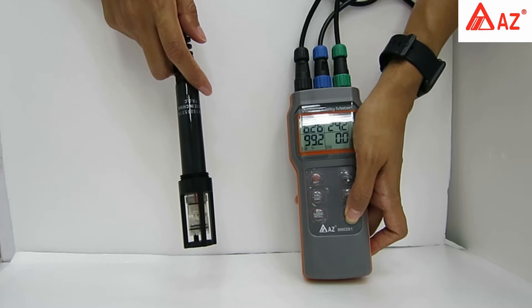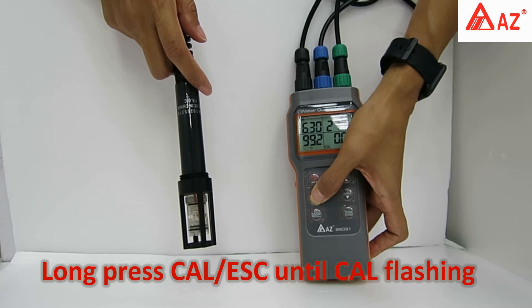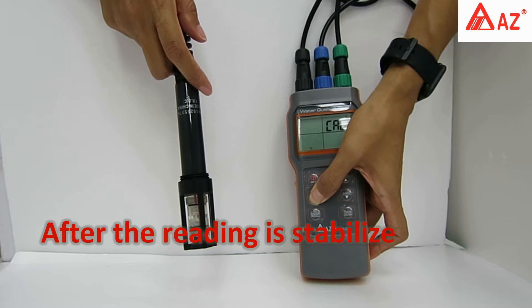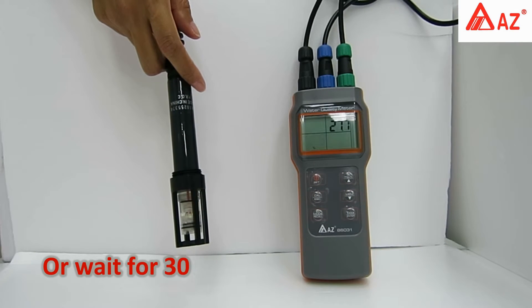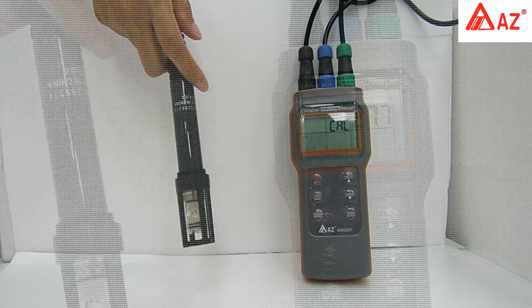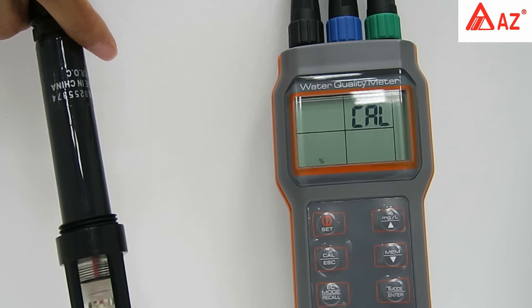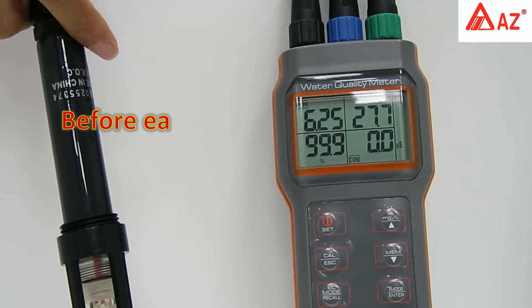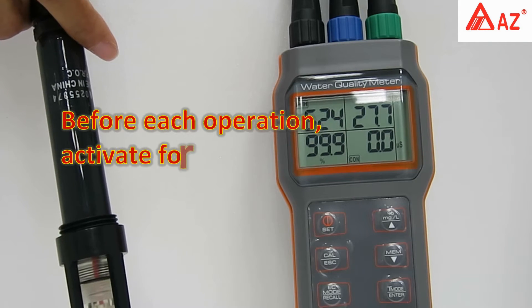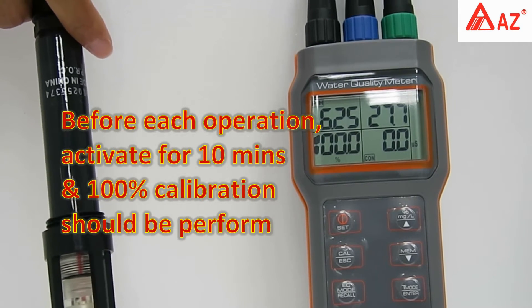Hold the DO probe in the air. Press T/Mode to switch to DO, then long press Cal until the Cal icon appears on the LCD. After the reading is stabilized, press Enter or wait about 30 seconds. The SA icon appears when the result is automatically saved and it returns to measuring mode. For accurate readings, turn on the meter 10 minutes before each operation and perform the 100% saturation calibration.